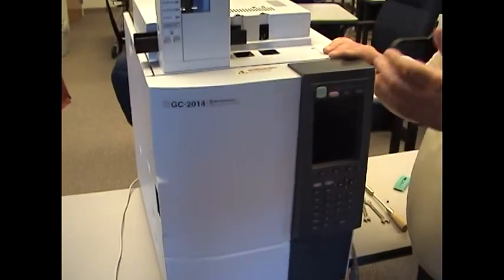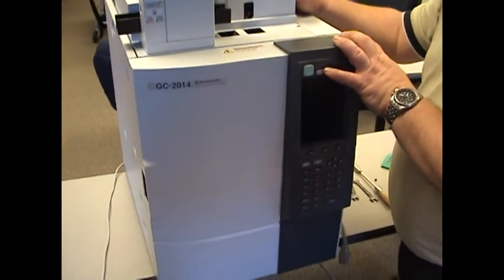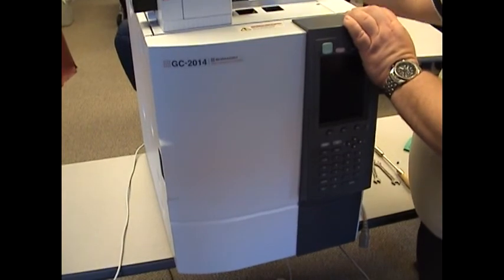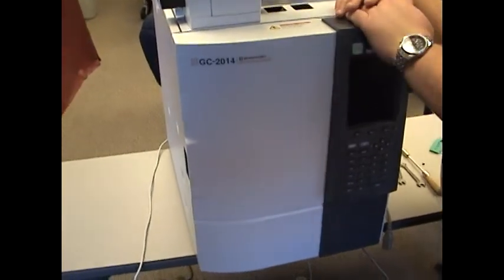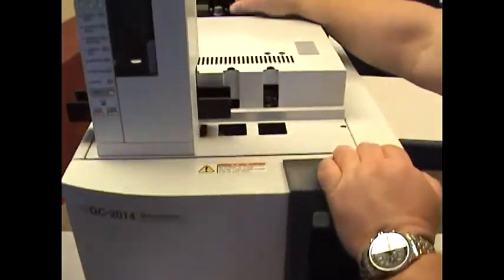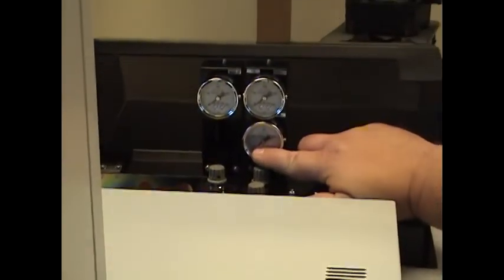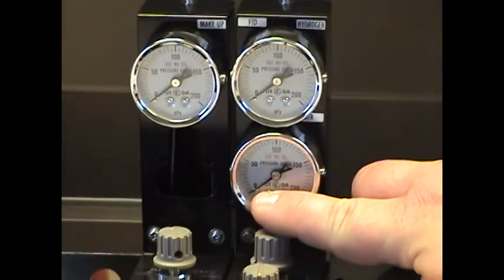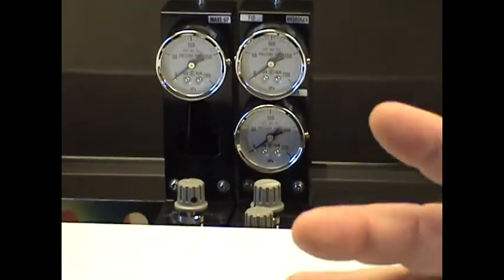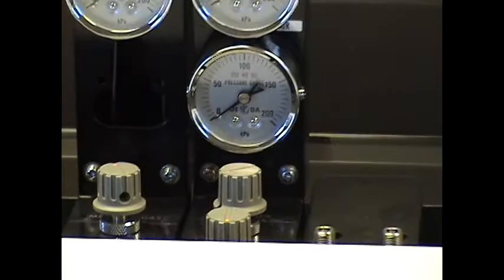The first thing you do is back out of your software and cool down the instrument, especially the detector. Make sure the flame is off. A lot of folks will think they've turned the flame off, but it doesn't happen. What I like to do, if you have air, is make sure I turn the air down to zero on the instrument and wait about ten seconds — that'll kill the flame. Let the rest of the instrument cool down, turn off your gases, and then you can turn off the instrument.